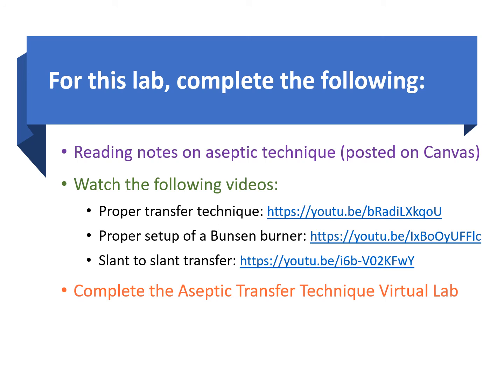Now you have notes provided for you on Canvas about the aseptic technique, so go ahead and take a look at it. It explains how, when you're using a needle or a loop, you've got to pass it through the flame so that you sterilize it, and how when you uncap a test tube, you've got to flame the mouth.